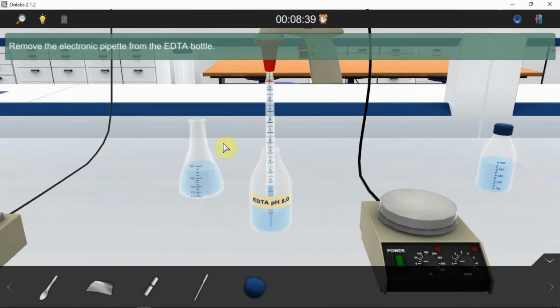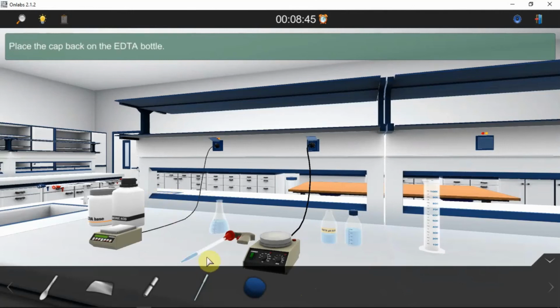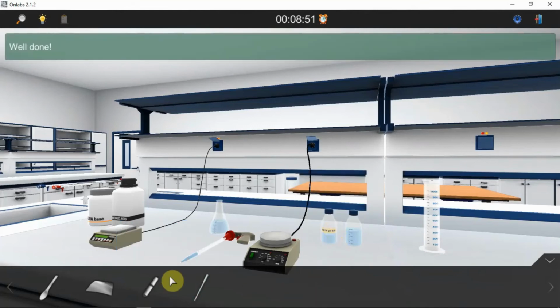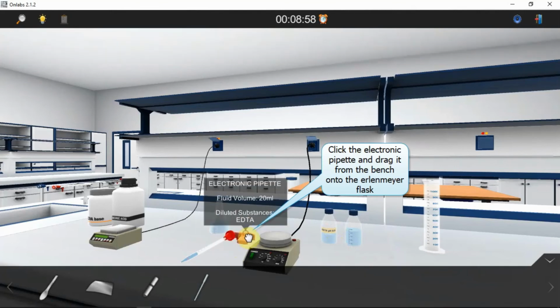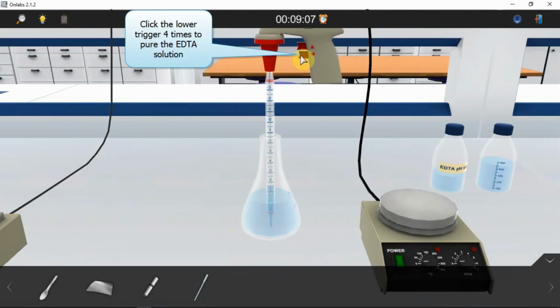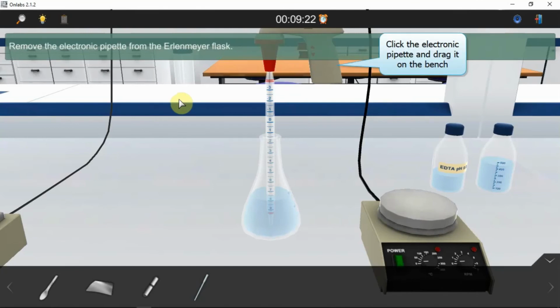Remove the electronic pipette from the EDTA bottle. Well done. Place the cap back on the EDTA bottle. Well done. Now put the electronic pipette in the Erlenmeyer flask. Well done. Pour the 20 ml of EDTA from the electronic pipette into the Erlenmeyer flask. Well done. You've poured 20 ml of EDTA solution into the existing solution of the Erlenmeyer flask. Remove the electronic pipette from the Erlenmeyer flask.